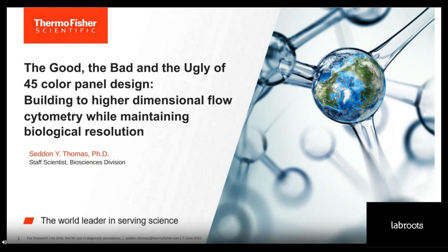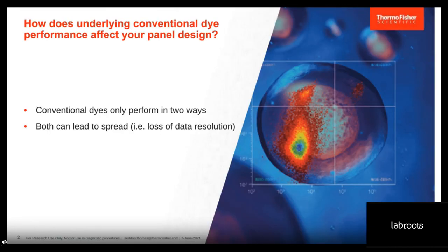All right. Thanks, Anson. Today, as Anson mentioned, I'm going to be talking about the good, the bad, and the ugly of 45-color panel design. And a lot of this is really thinking about, as you build to more and more colors, how do you maintain biological resolution? When I initially started thinking about how dyes affect your panel design, I had to step back and realize how much we're actually accounting for bad dye performance.